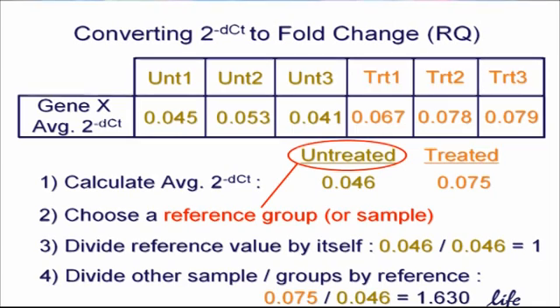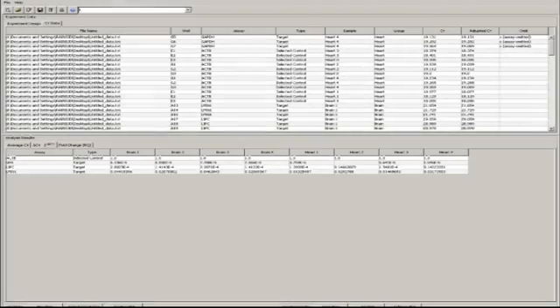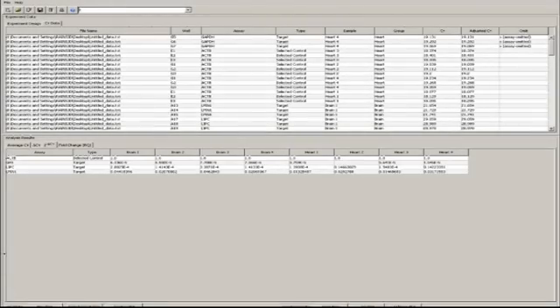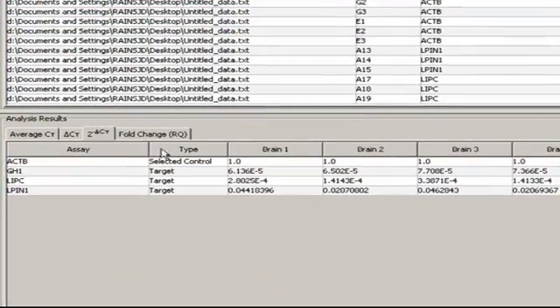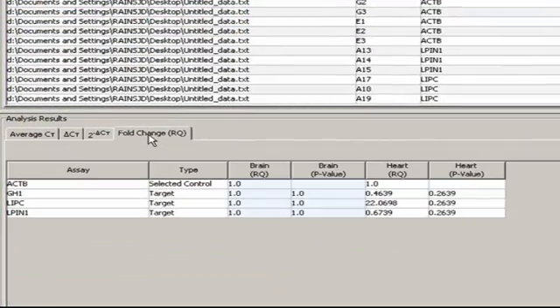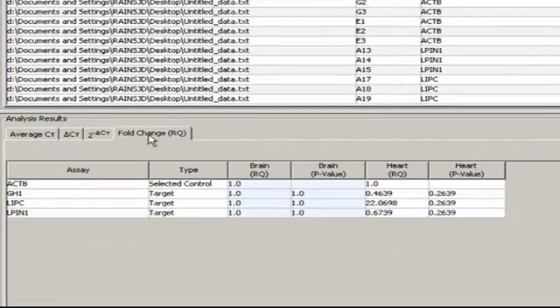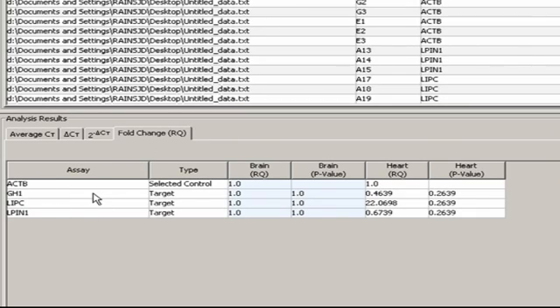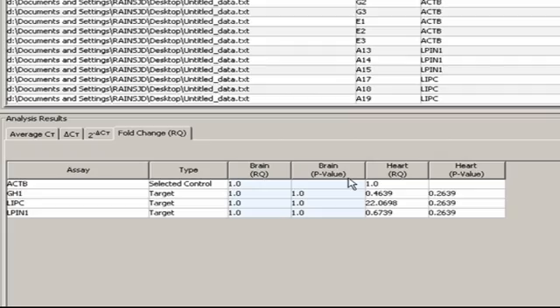In this example, the expression of GeneX went up approximately 60% when we treated our samples. Let's go back to our actual example. Under the Fold Change tab, we can see that DataAssist has performed these same calculations for each target gene and on each biological group.